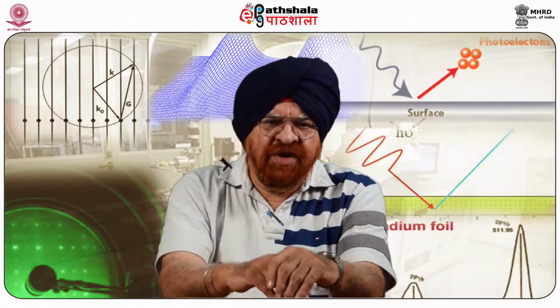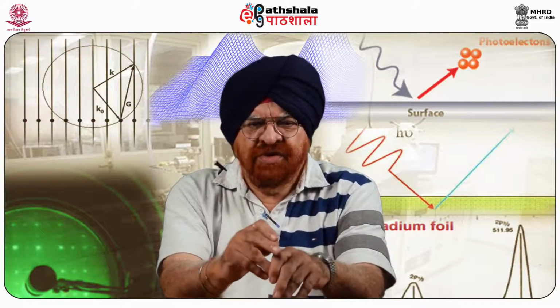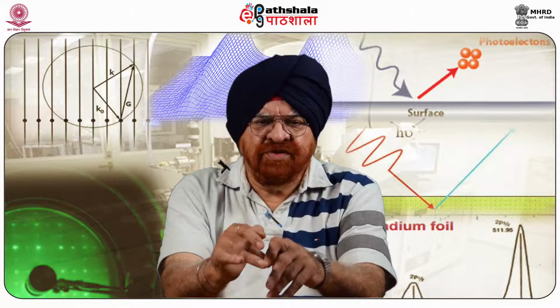The cantilever in AFM is a reference electrode that forms a capacitor with the surface, over which it is scanned linearly at a constant separation.